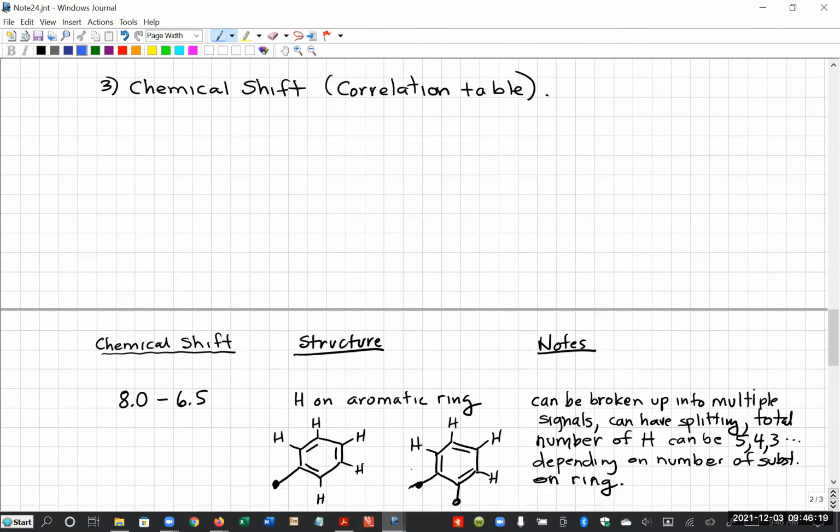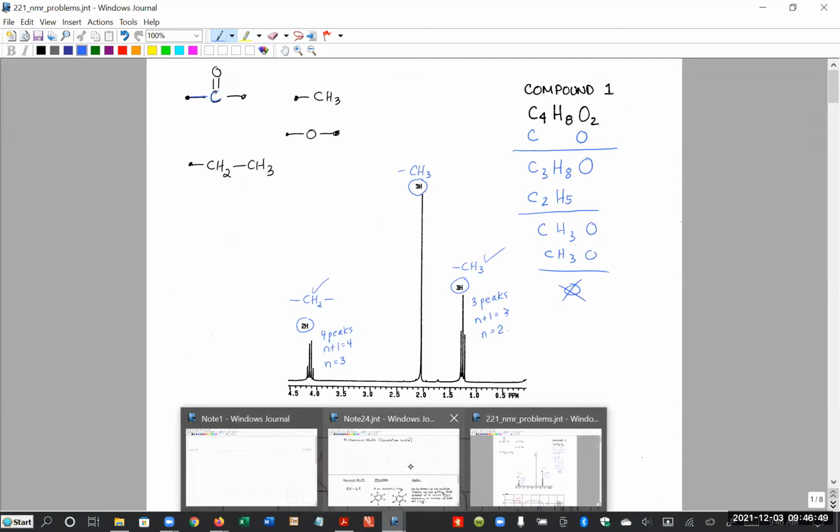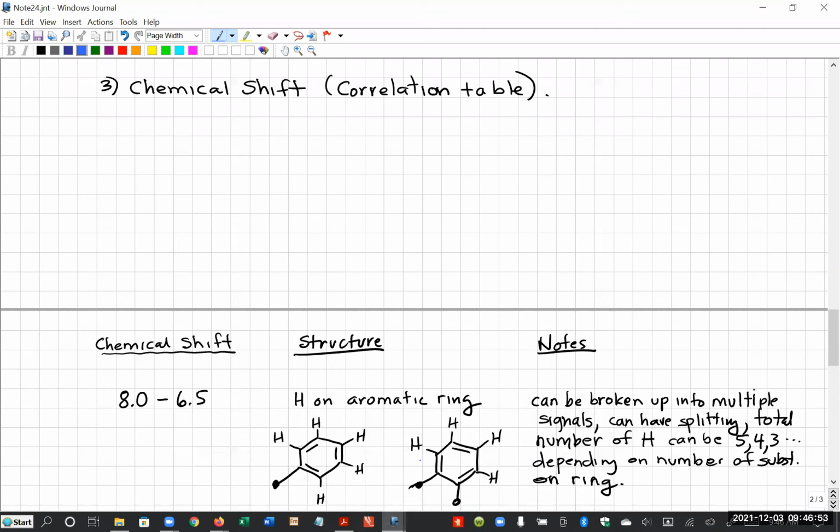Okay, so I wrote the heading and then I ran out of room. So to work out what dots are connected to which, what substructures are connected to each other, we're going to use the chemical shift. The chemical shift relates the position of the peaks, the numbers down here where the peaks come, to substructures and different things that we see in organic molecules, okay? The correlation table I've given you, as I pointed out, has lots of different things. What I'm going to do is summarize a few of the most common ones that we will probably see in our simple NMR problems that we're going to be working at for our first assignment here.